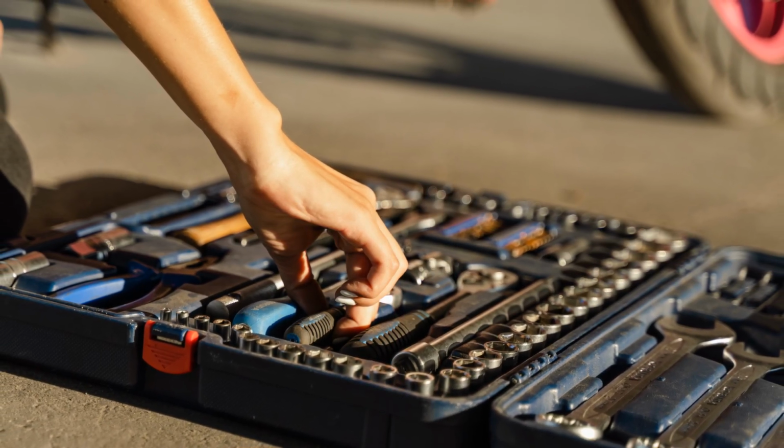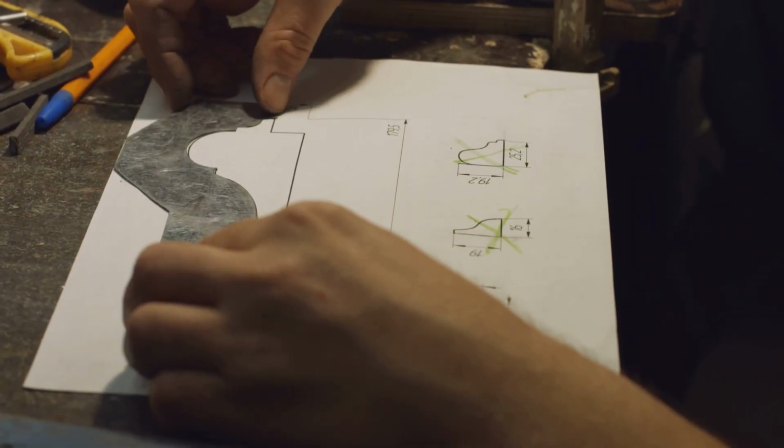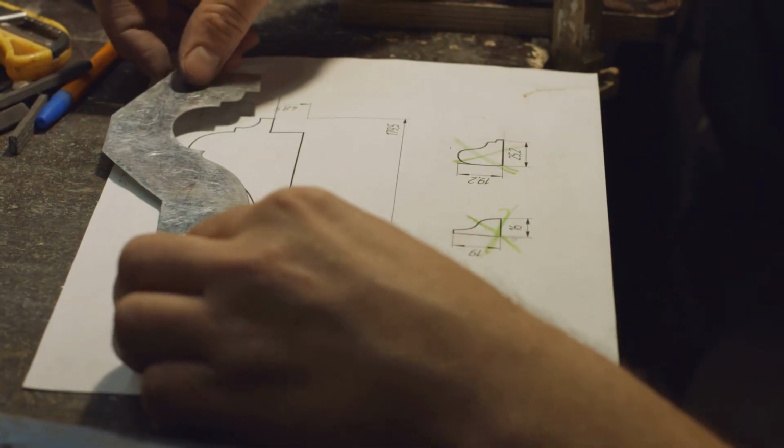Think of it like a toolbox. You wouldn't use a sledgehammer to hang a small picture frame. You wouldn't use a tiny screwdriver to break up concrete. Light microscopes and electron microscopes are different tools for different jobs. Each has its own unique set of strengths and weaknesses.